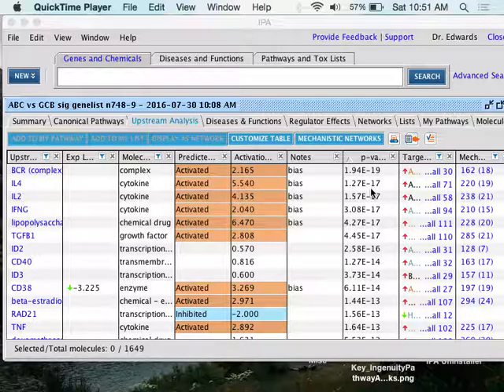That was tough. But basically anything that leaves a mark in the transcriptome, I can see. If it affects genes and we know what kind of genes it affects, I will see it here. It can be drugs, it can be microRNAs. I think this is one of the best ways.